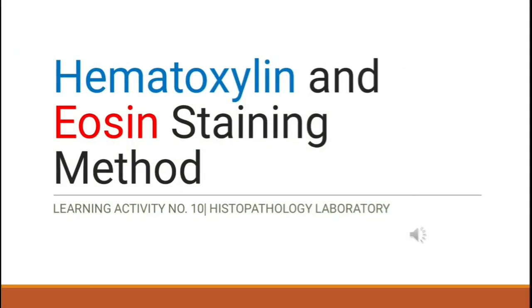Let us proceed to our learning activity number 10, which is entitled Hematoxylin and Eosin Staining Method. Hematoxylin and Eosin, or commonly known as H&E staining, is the most widely used staining technique in histopathology. As its name suggests, H&E stain makes use of a combination of two dyes, namely hematoxylin and eosin. This combination differentially stains various tissue elements and makes them easy for observation.